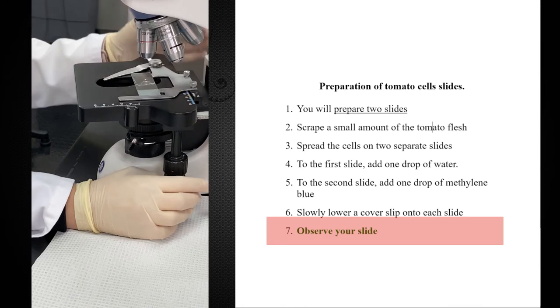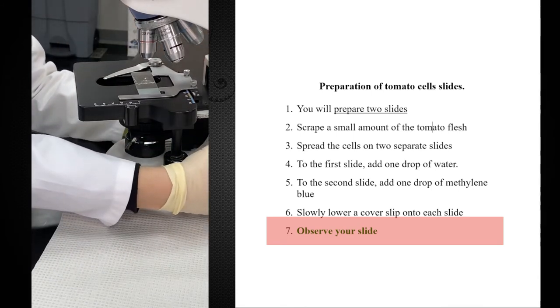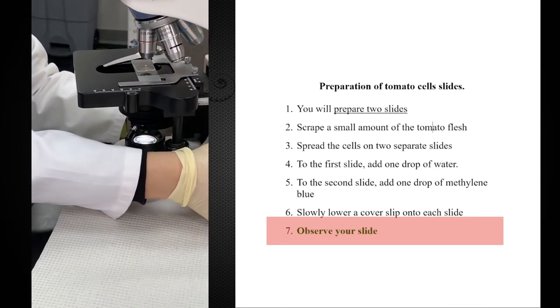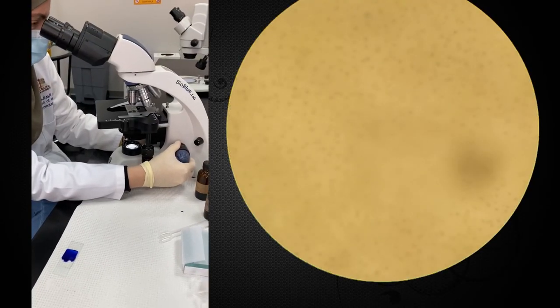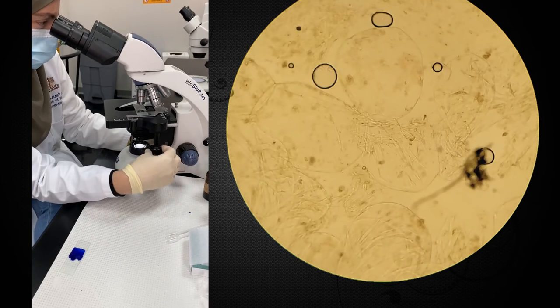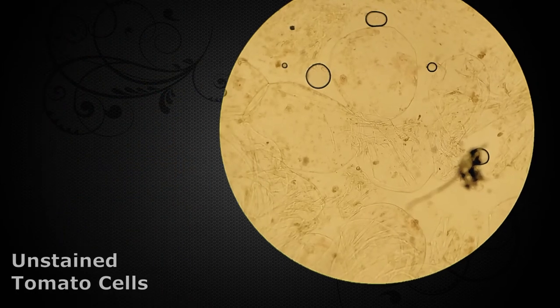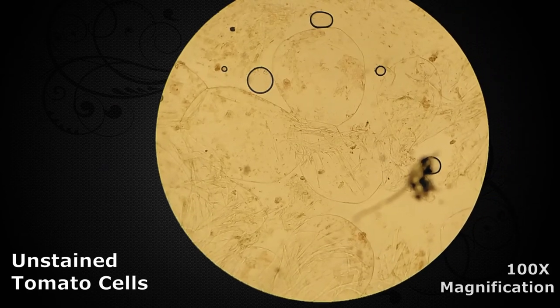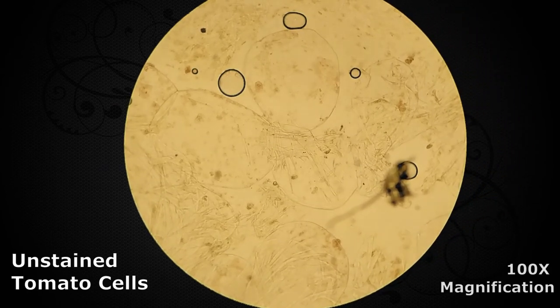I click the lowest magnification and with the coarse adjustment knob, I take the stage all the way up. I start looking and moving the stage slowly, slowly down until the image is clear. Tomato cells are big, large cells. Probably this magnification is enough, or I can move to the next magnification.